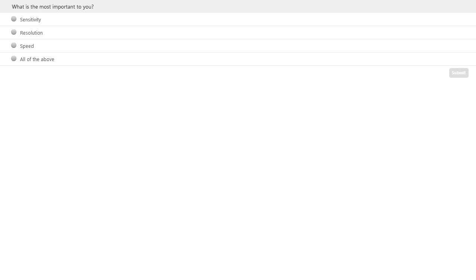Or do you go for speed? Do you like to collect your spectra quickly? 1 second or 10 seconds is pretty common these days. Your maps could be collected in 2 or 3 minutes, which is not uncommon at all these days. So which is important to you? And of course, many of you might say all of the above, and that's because we don't like to do compromises. So we want our detector performing all around very well.